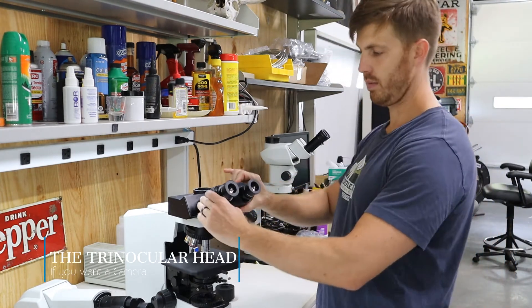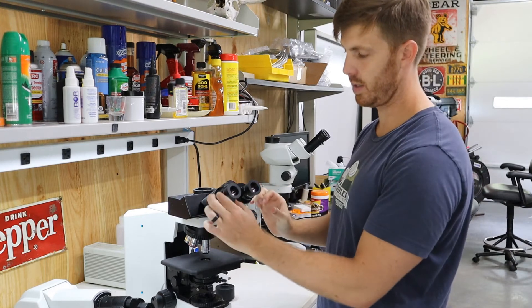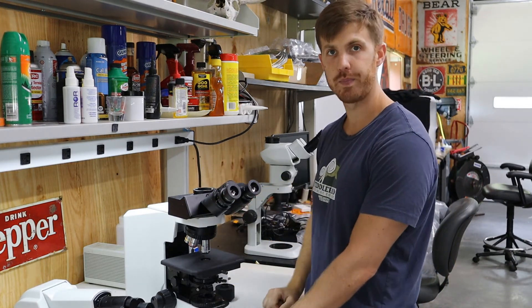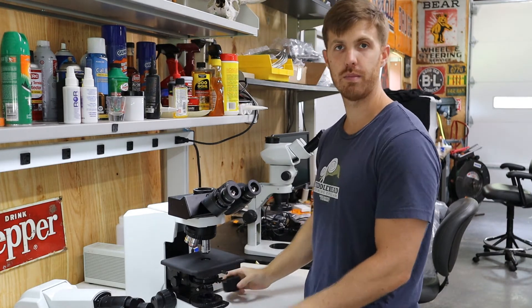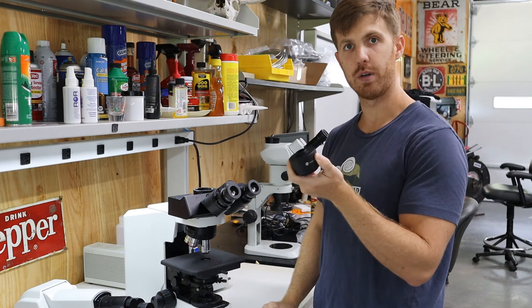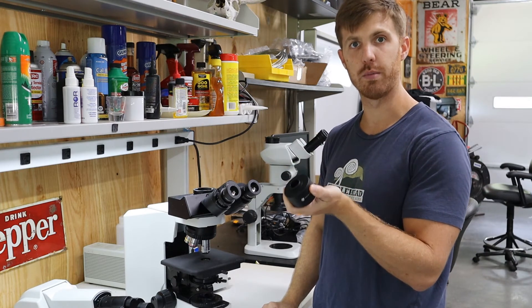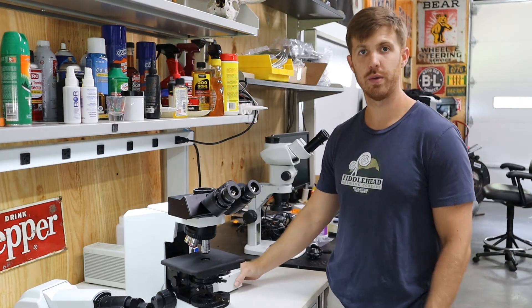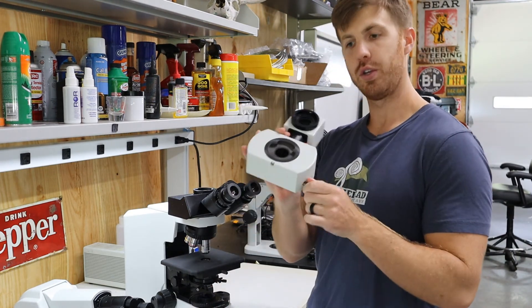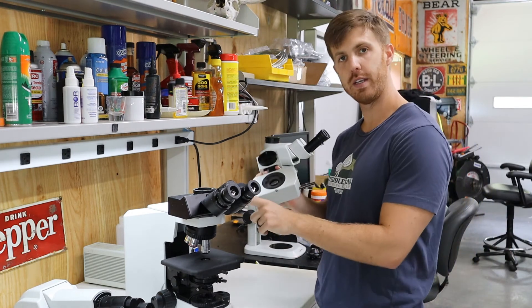Finally, we're going to show you the trinocular head from Olympus. Distance between the eyepieces and diopter tube work the same. The big perk of this one is you can put a camera on top. If you're going to put a camera on top, you will need a C-mount adapter or an F-mount adapter to hook a DSLR camera to.